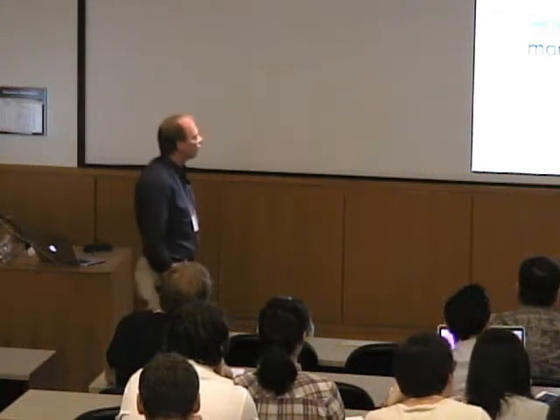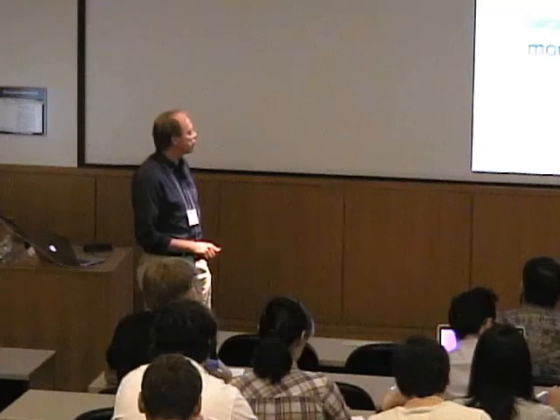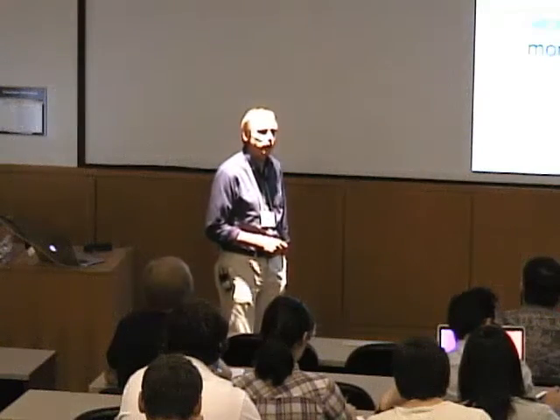What's actually very important for EPR, which is sometimes not mentioned so much, is that molecules that have paired electrons, of course, have no magnetic moment and therefore have no EPR spectrum. And that turns out to be a two-edged sword. It's a bad thing because there are many compounds that you can't observe with this method. But on the other hand, it can also be a strength, because if there are compounds present in your sample that you don't necessarily want to see, then they don't interfere with your spectrum.